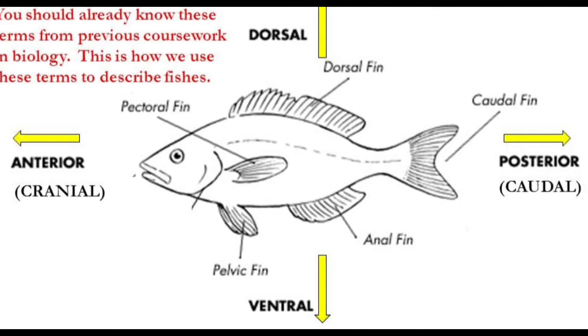Posterior describes the rear end or tail of the fish. The caudal fin, which is the main tail fin, is located on the posterior end of the fish.